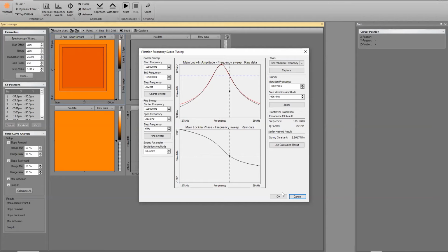Okay, a couple more just came in. So you said you prefer using hollow FlexAFM cantilevers. Is that generally the best option? Would you recommend that to everyone? Or is that just a personal preference? It's probably a personal preference. They have their advantages, they have their disadvantages.